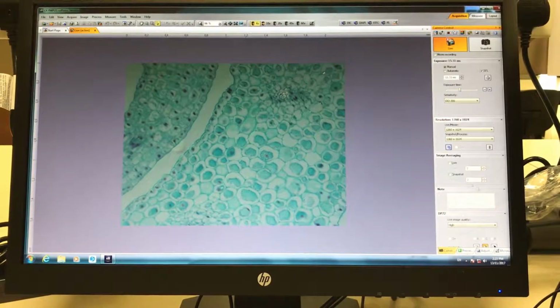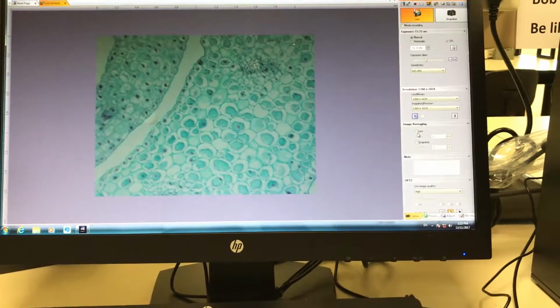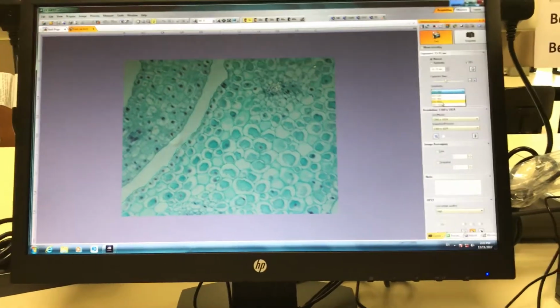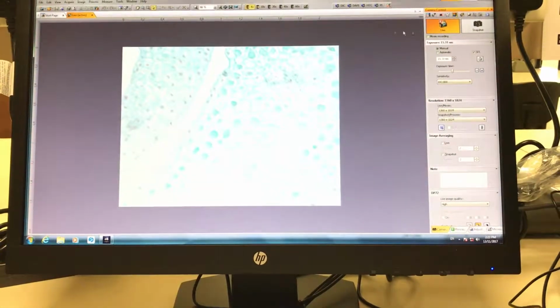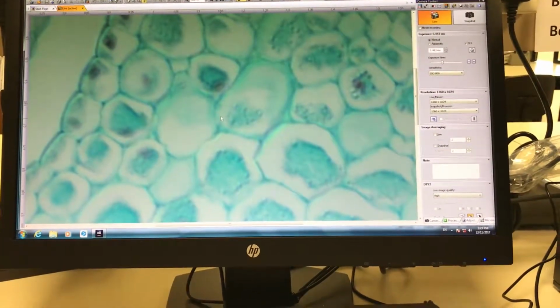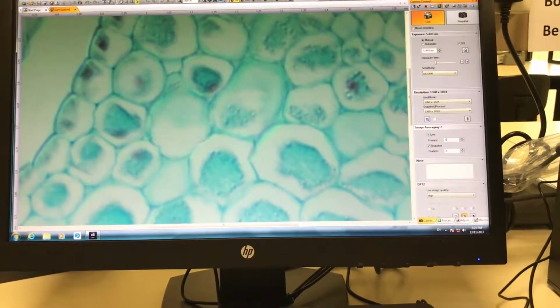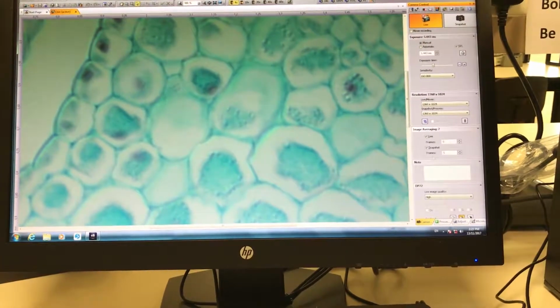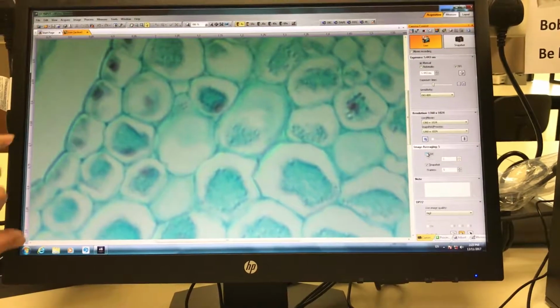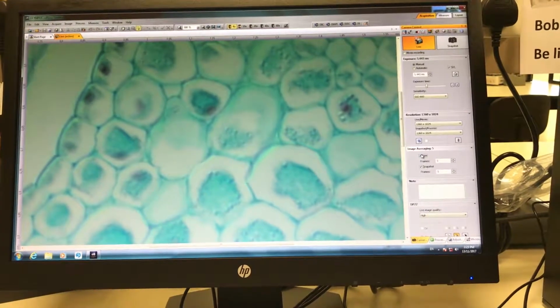Okay, and then image averaging is a way that can help to reduce the noise of the image. So just now I said that when you set to high sensitivity, the background noise seems to be high. So if you do image averaging of 5, then you will see, this is with a lot of background noise. When you do image averaging, the noise level will be reduced.